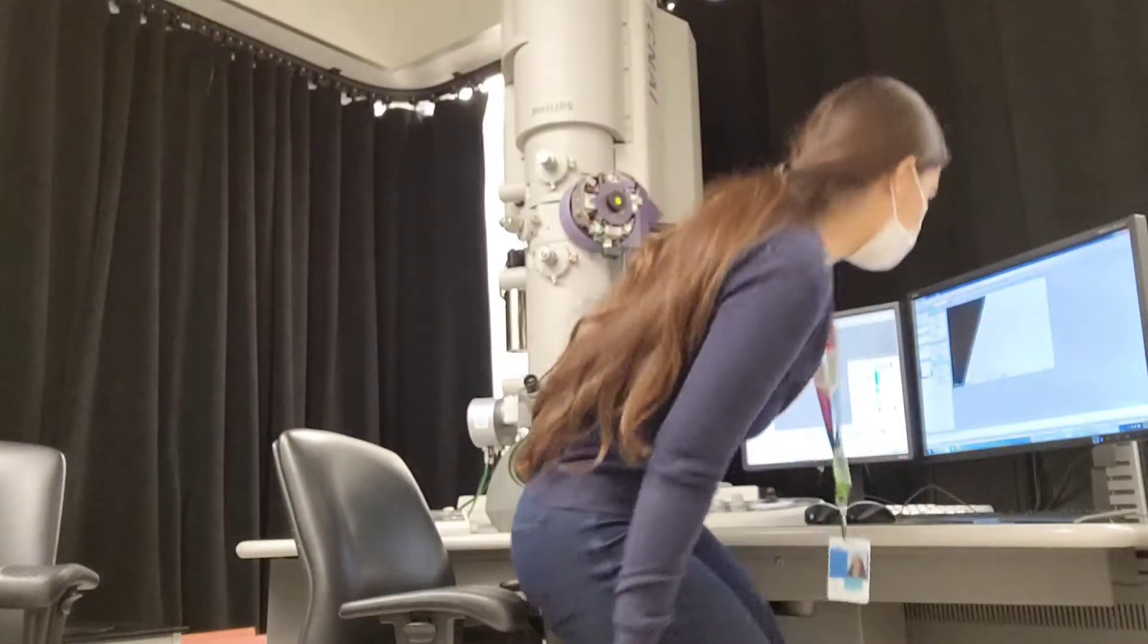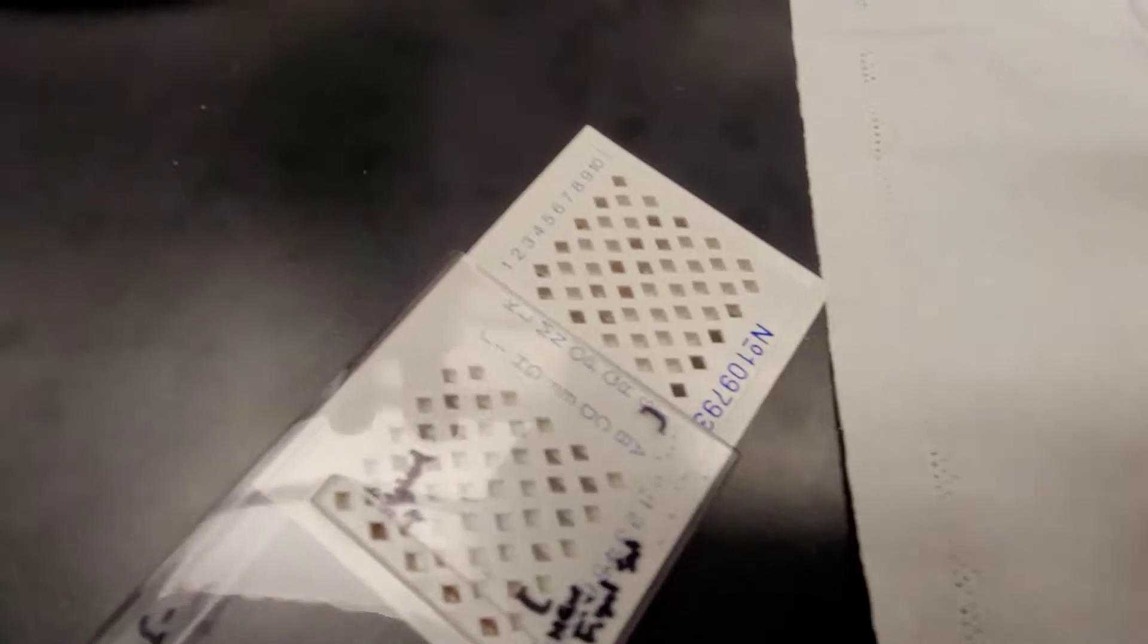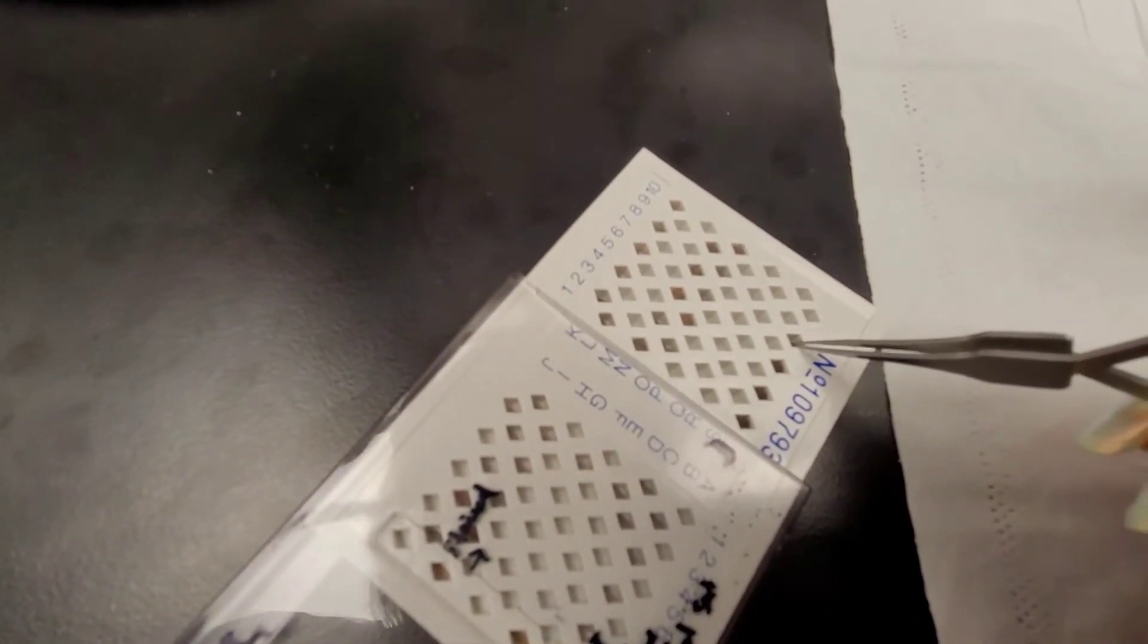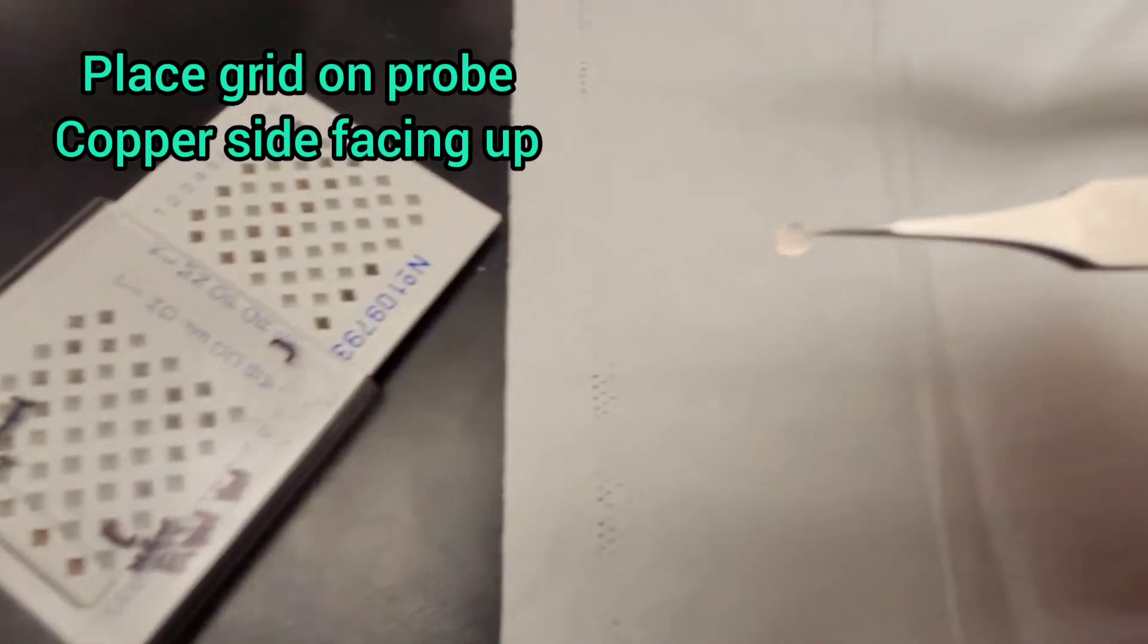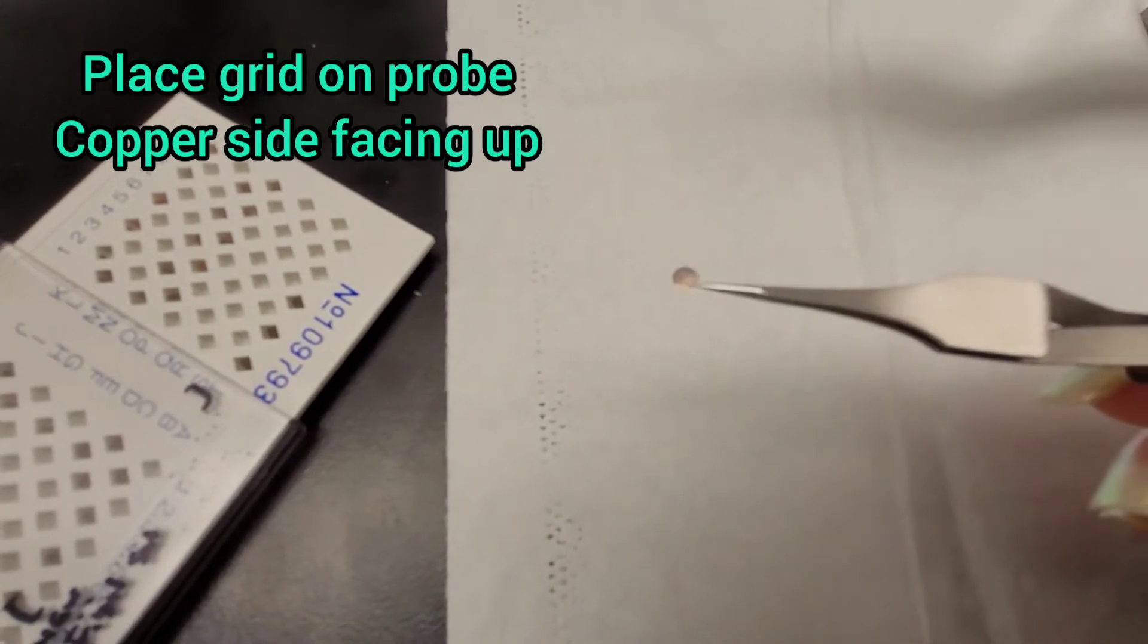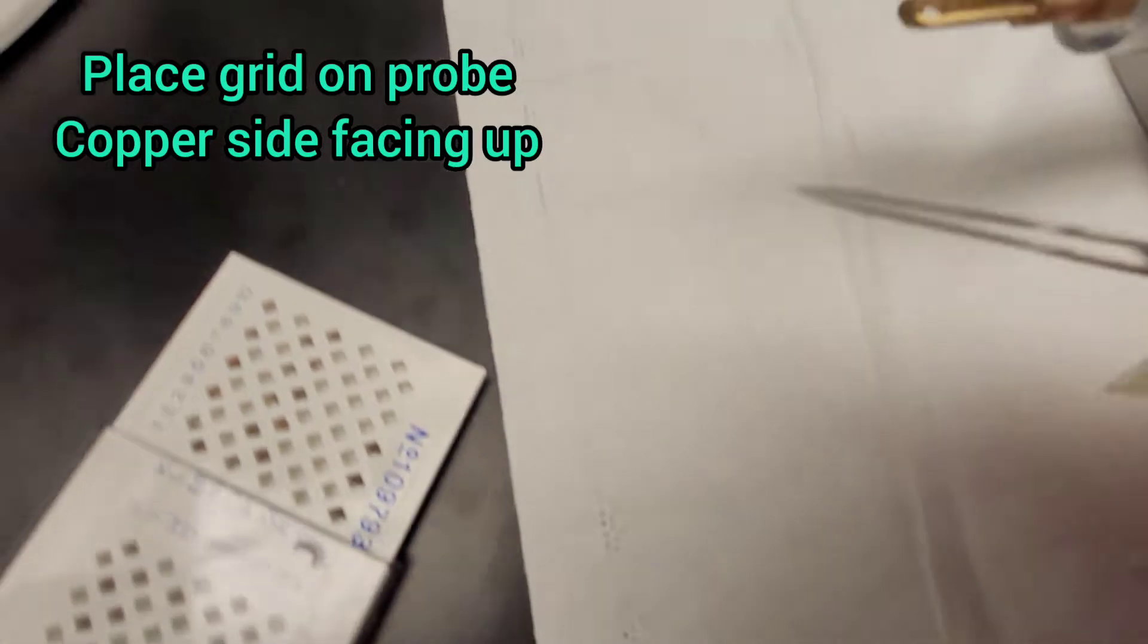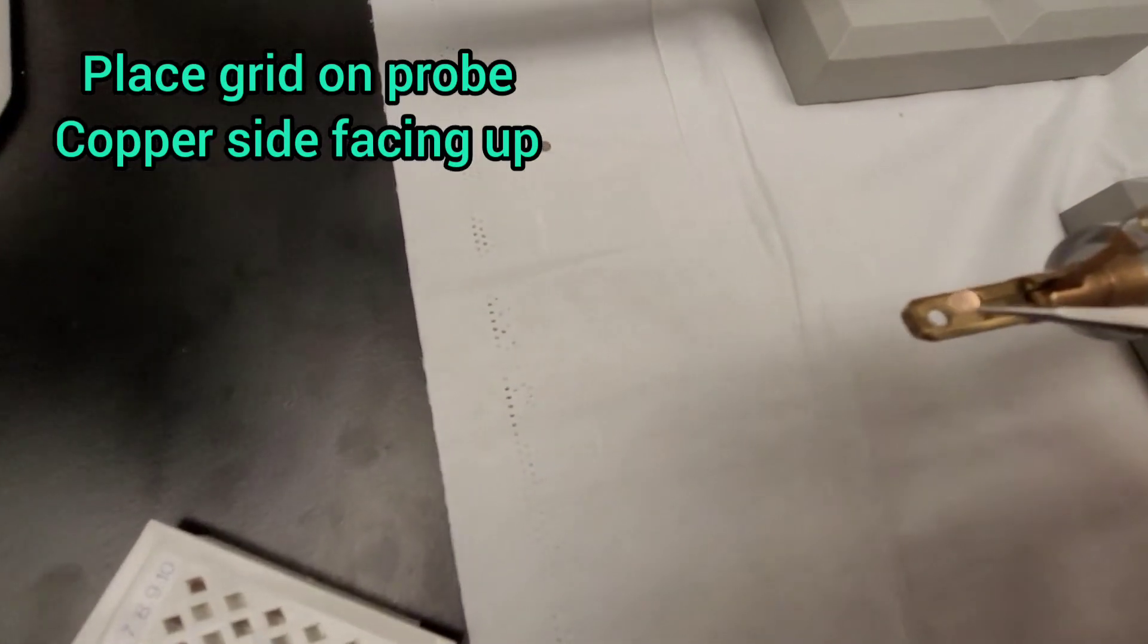Today I want to show you how I do electron microscopy, basically how I use the instrument itself. First, you take your stained grids, which have a copper shiny side and a black carbon side.